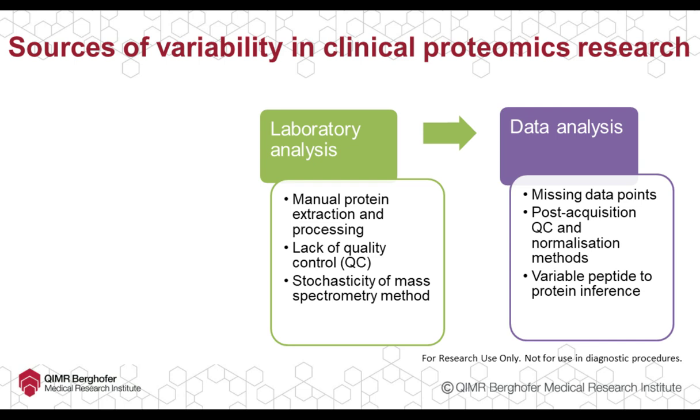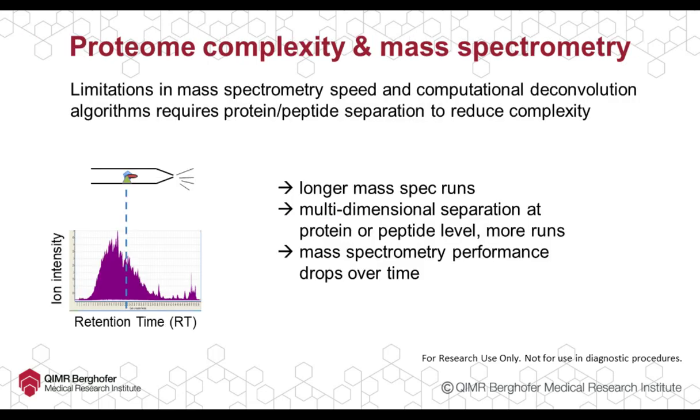In terms of that, for a single study, obviously one should use a single algorithm just to not have a variable across different samples. So there's limited choice in that aspect.